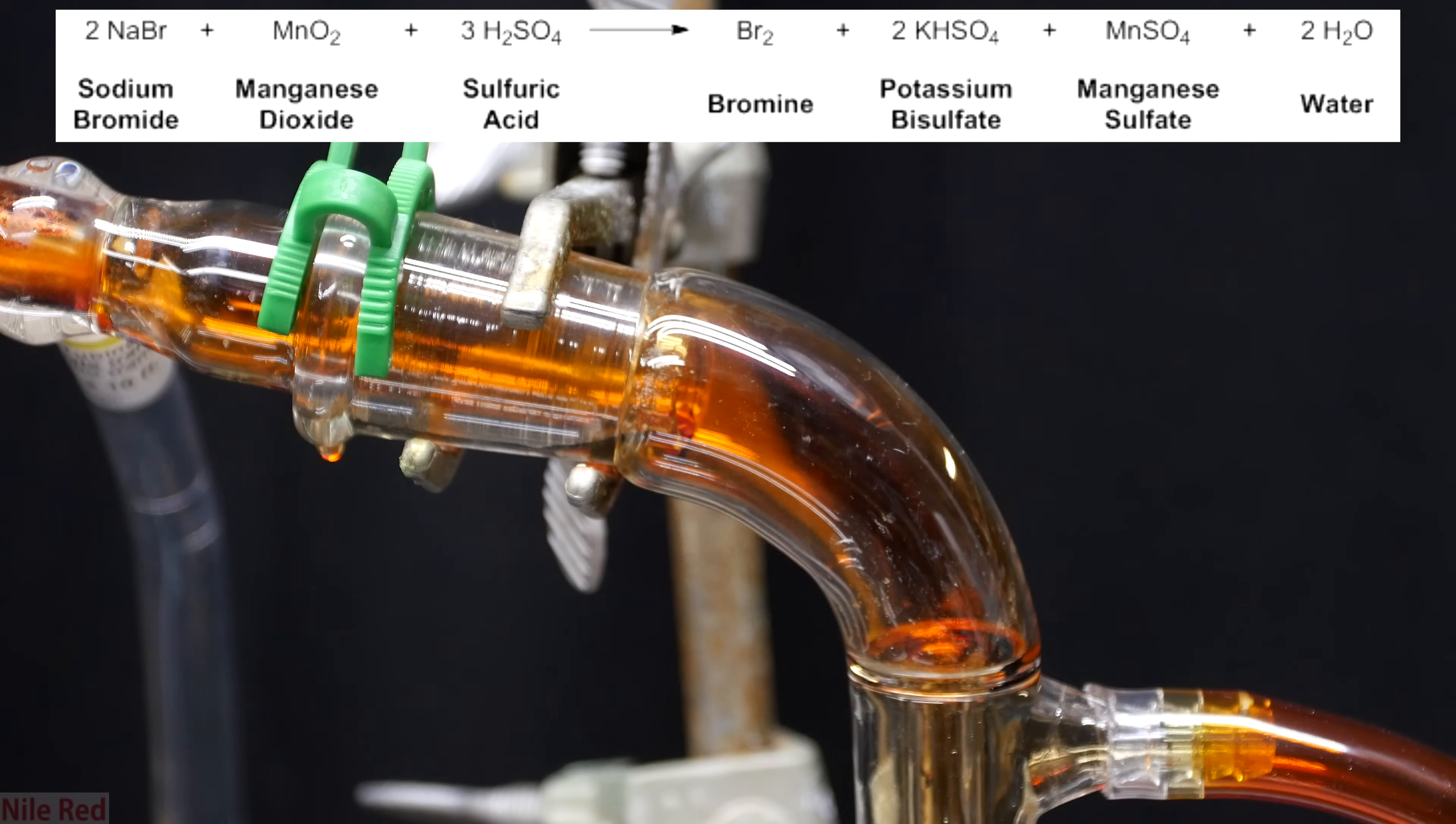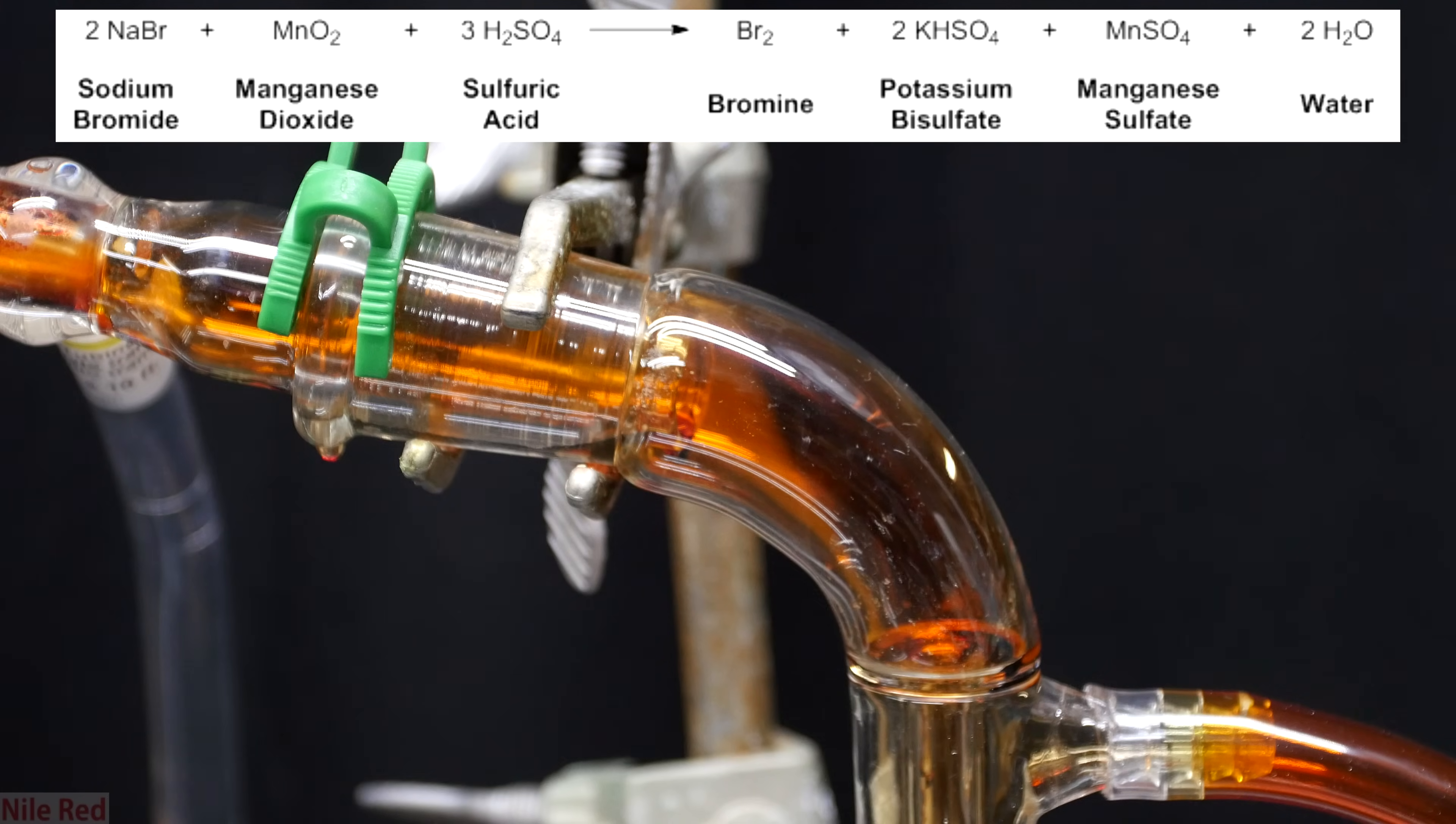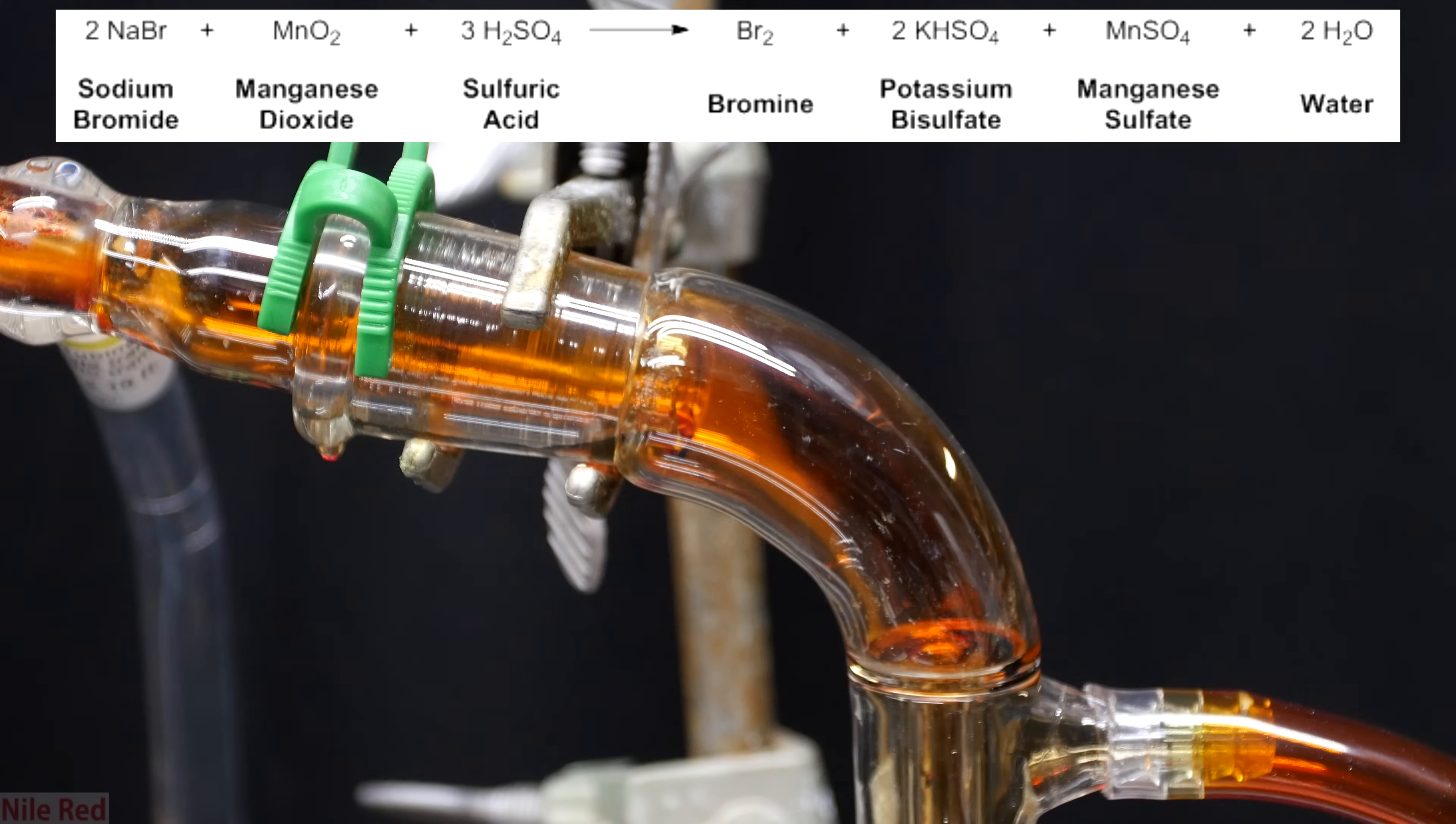The manganese dioxide is acting as the oxidizing agent, and it's oxidizing the bromine anion in sodium bromide to elemental bromine. Because it's just acting as an oxidizing agent, it can be replaced with other oxidizers. Some examples of other oxidizers are things like potassium permanganate or hydrogen peroxide.